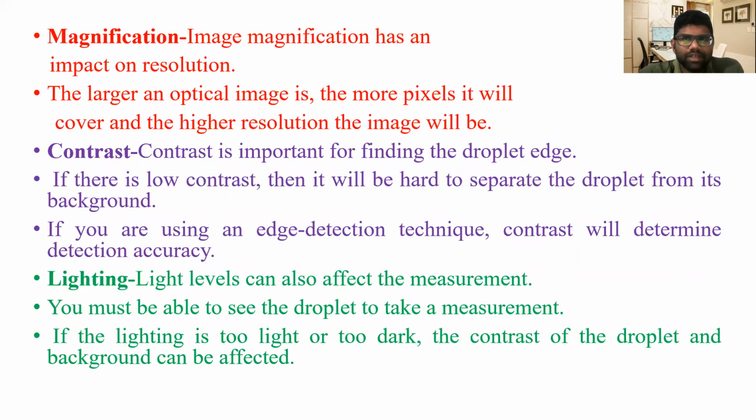And magnification. Image magnification has an impact on resolution. The larger an optical image is, the more pixels it will cover, and the higher the resolution the image will be. So this is the importance of magnification.